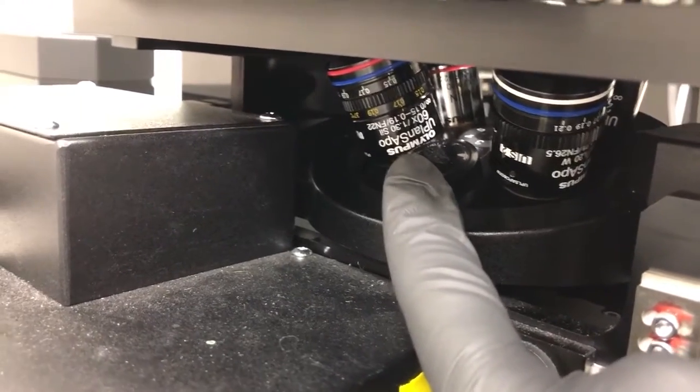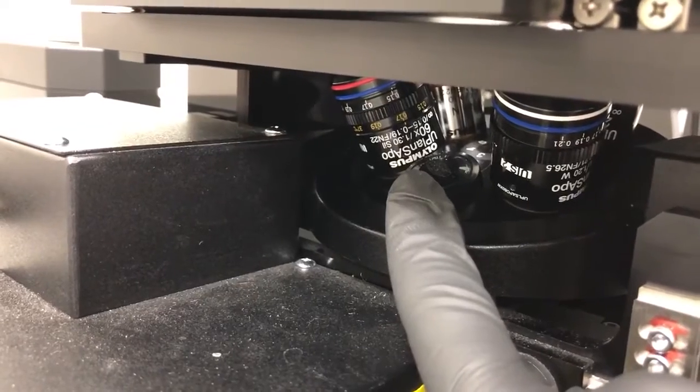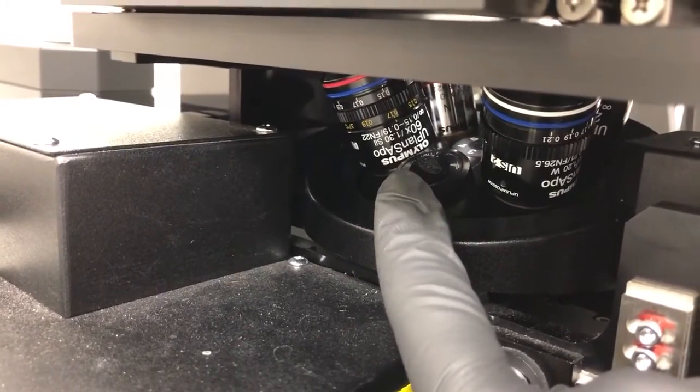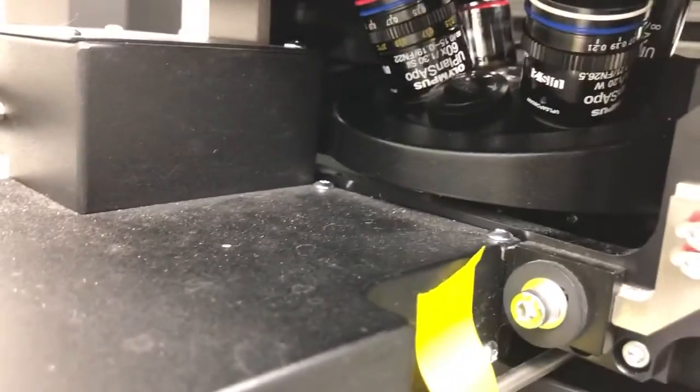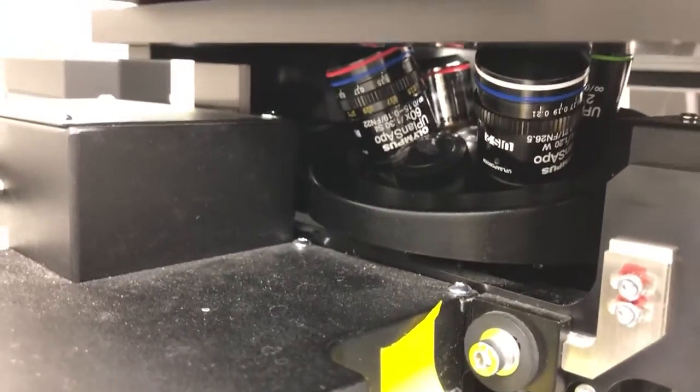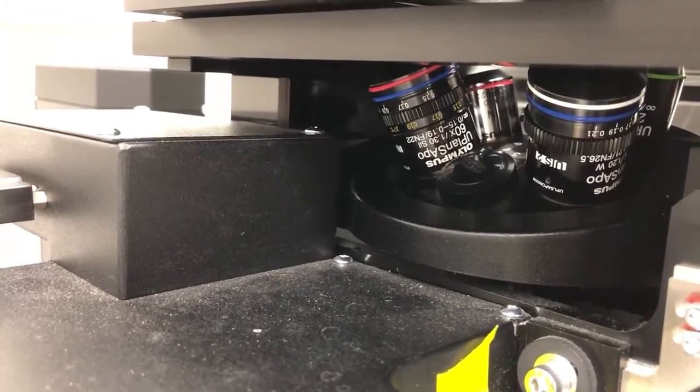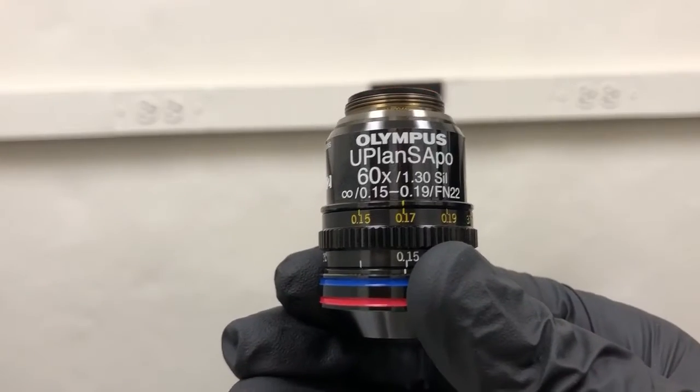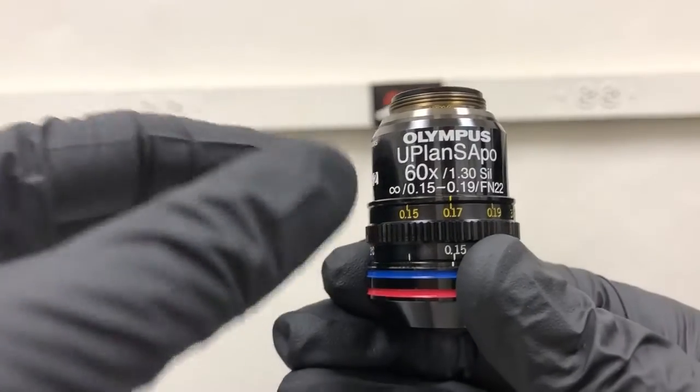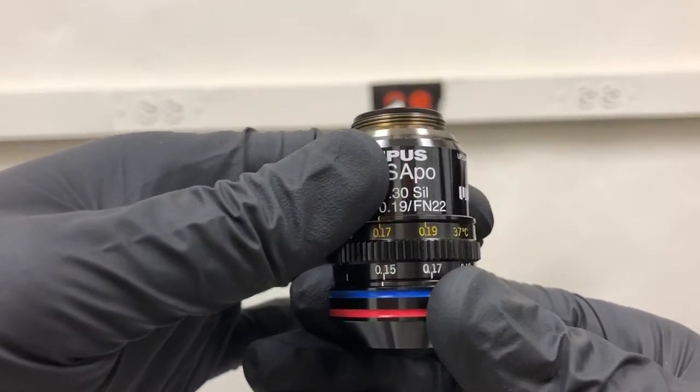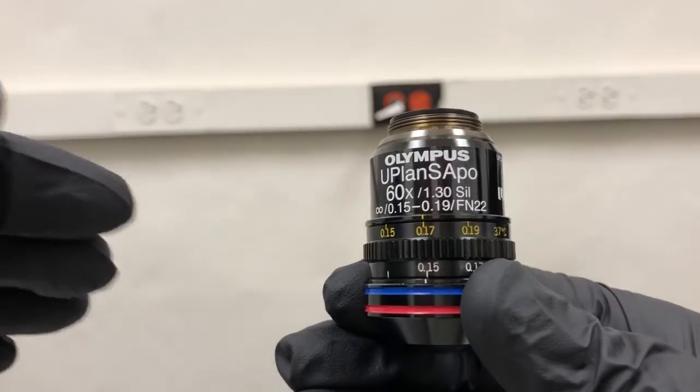I'm going to remove it from the microscope and show you how those markings look up close, so then you know what you're looking for when you're peering down the side of the microscope. I've removed the 60x oil objective from the microscope just so you can see what the markings look like and what it is that you're going to be adjusting if needed.